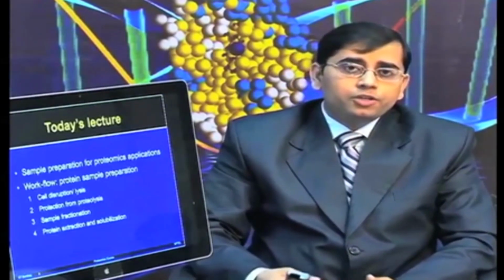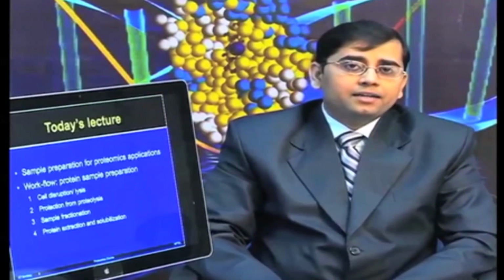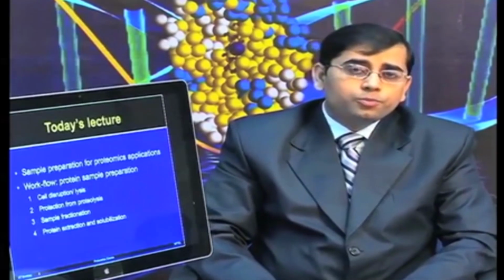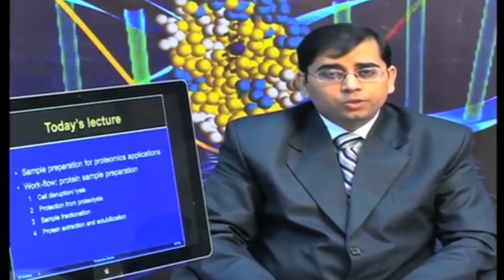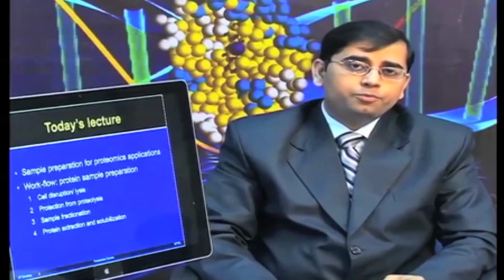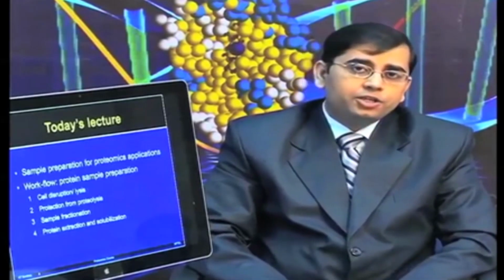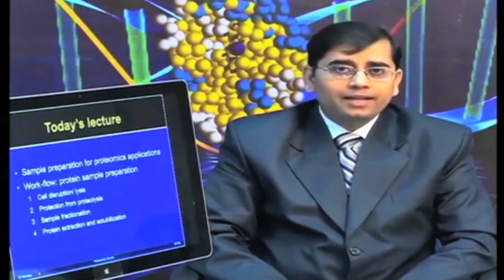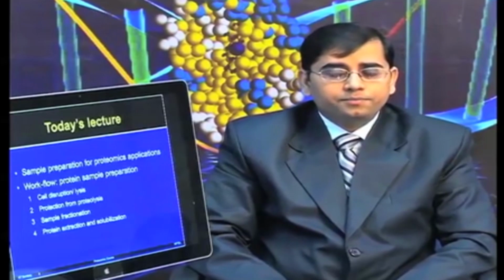Often you need to simplify the proteome, you need to ensure that the sample is simple enough to show the good protein throughout the proteome coverage. So, to obtain a comprehensive proteome coverage, often it is important that you pre-fractionate your samples. Protein extraction and solubilization are another very essential component.